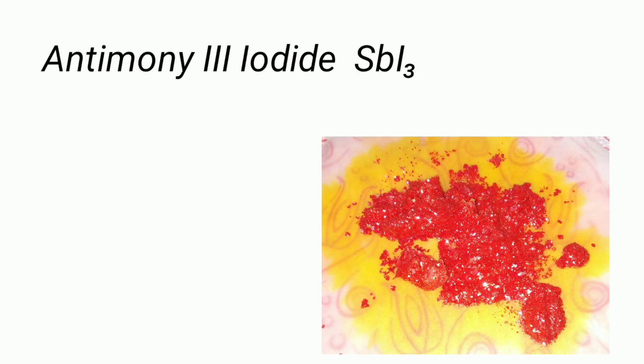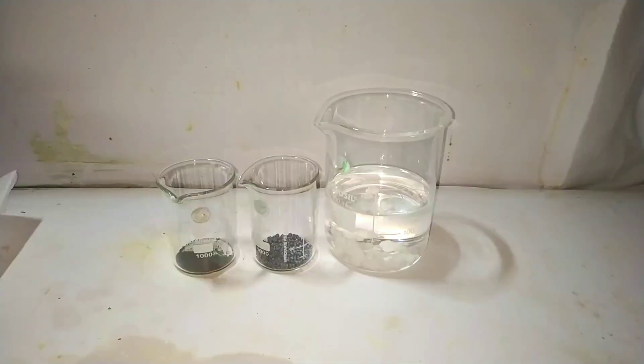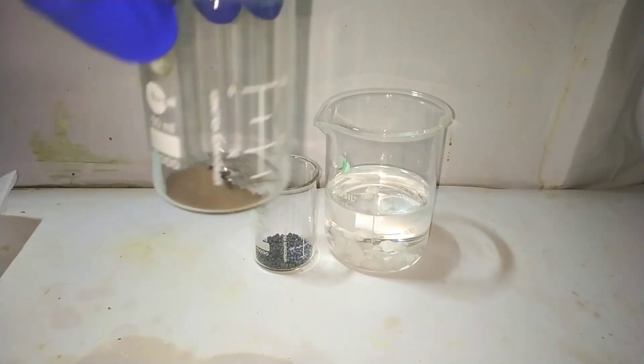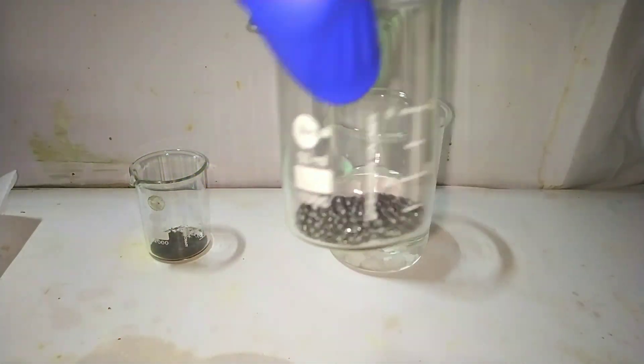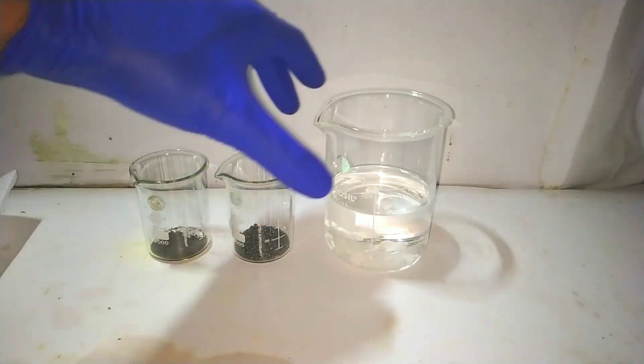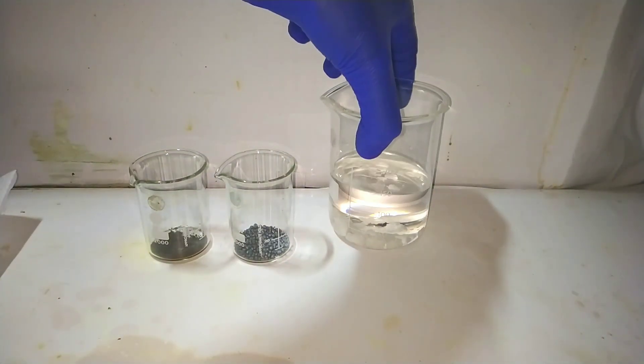Antimony 3 iodide is a ruby red colored compound formed by the direct combination of antimony with iodine in a suitable solvent. Materials required for this preparation include 3.5 grams of antimony, 7 grams of iodine, and 150 milliliters of toluene. Here we have all the reactants ready: 3.5 grams of antimony, 7 grams of iodine crystals, and 150 milliliters of toluene dried with anhydrous calcium chloride.